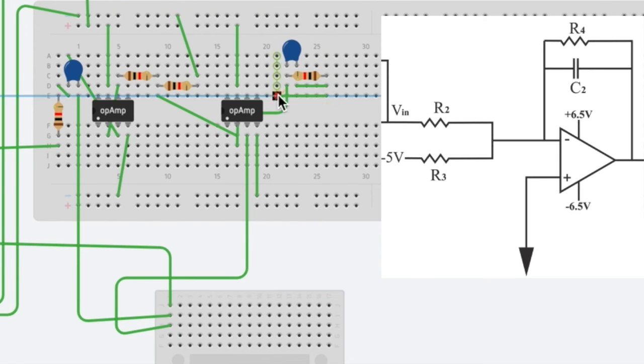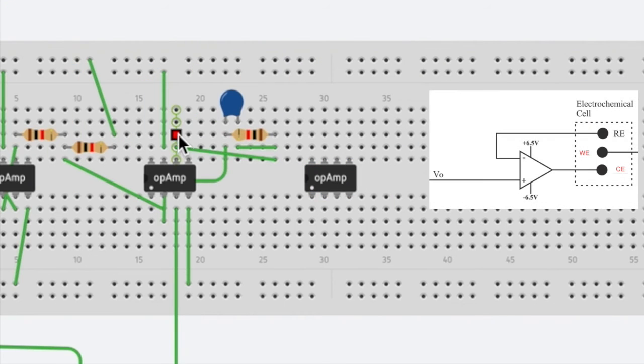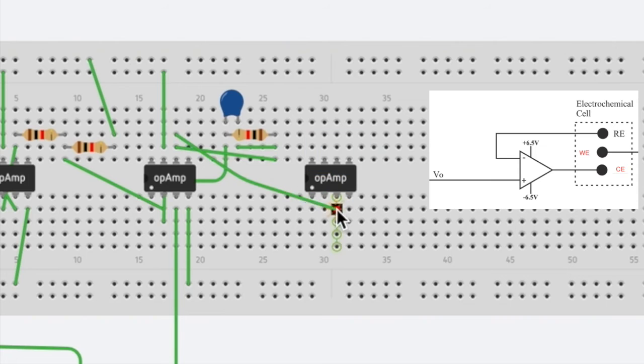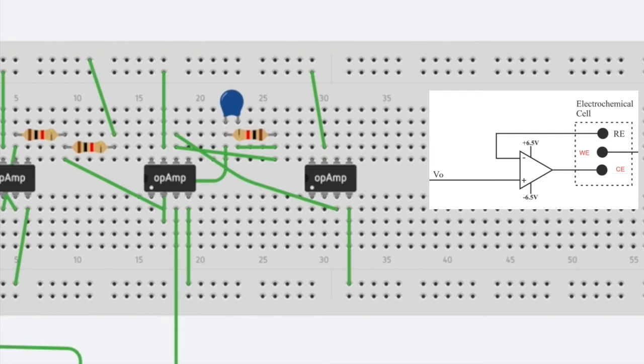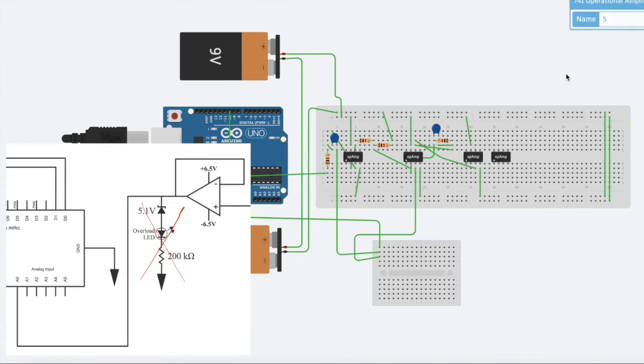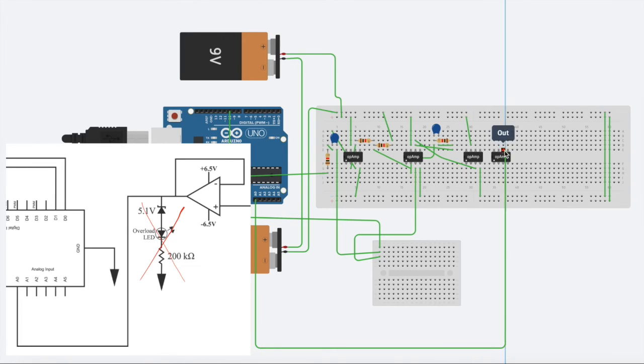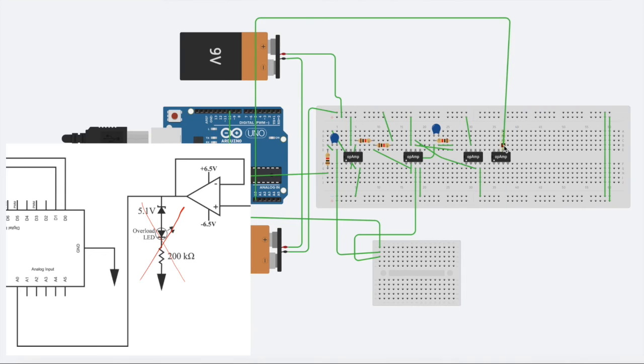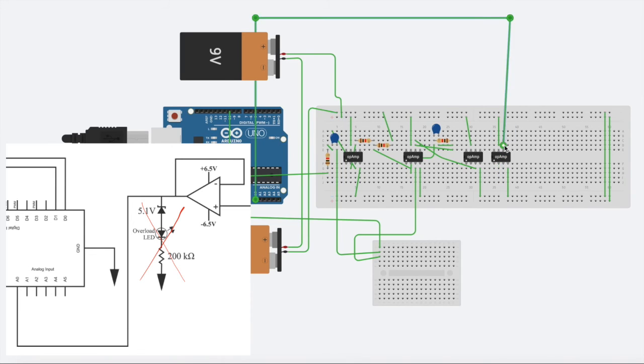Next, we will assemble the electrochemical cell. This simply takes the output of the previous op amp into the non-inverting input of this op amp. Then the inverting input will act as the reference electrode, and the output will act as the counter electrode. Heading to the bottom left of our circuit diagram, we will now assemble the operational amplifier connected to the analog input. This means that we will just simply take a wire from the A0 input, put it into the output of an op amp, connect it to the inverting input, and then connect the non-inverting input into the output of the next amplifier.